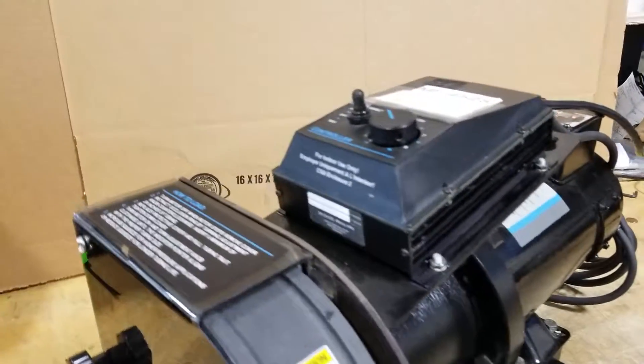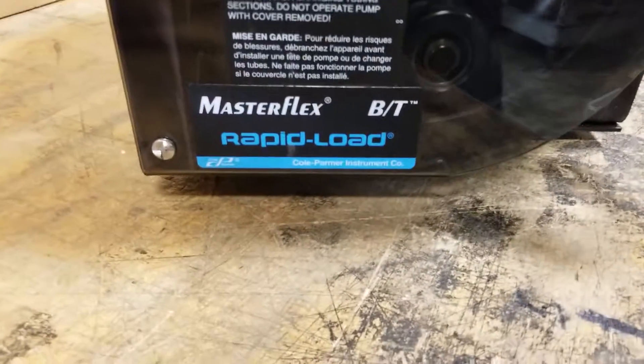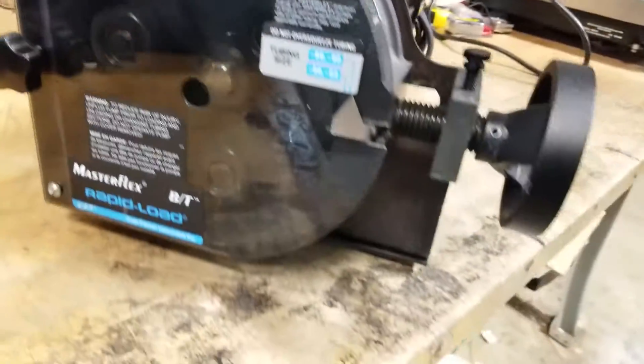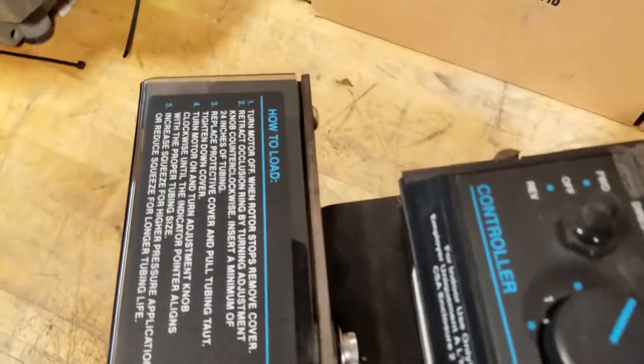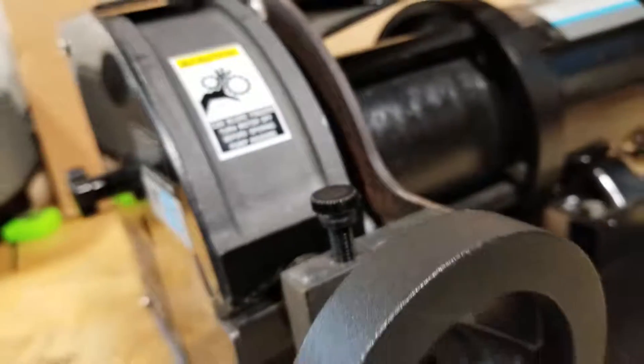Sitting on a Kohl Palmer, this is a MasterFlex BT Rapid Load peristaltic pump. It is in pristine condition physically and working. I'll have individual shots on all of the parameters of this piece of equipment. This came from a lab consolidation of a large pharmaceutical company. It was represented as fully functional.